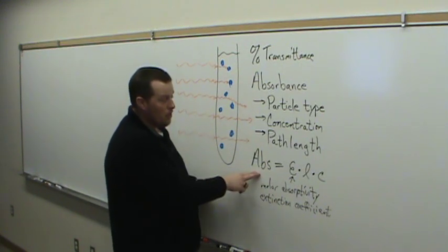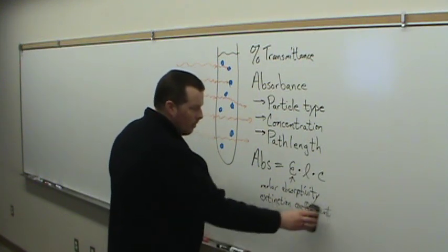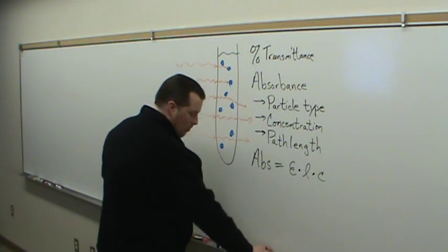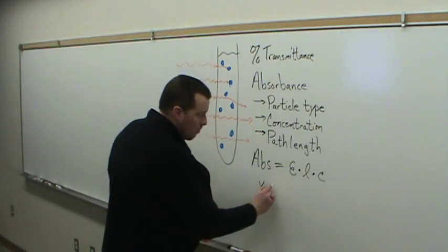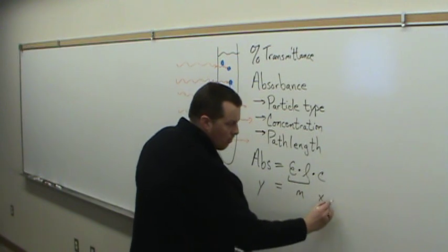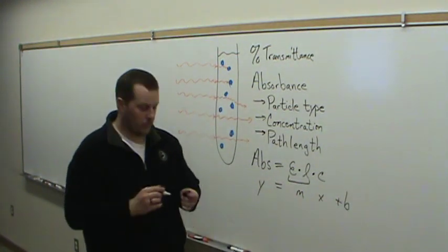The other thing to keep in mind when we're looking at Beer's Law is, what kind of an equation is this? Beer's Law is the equation of a line.